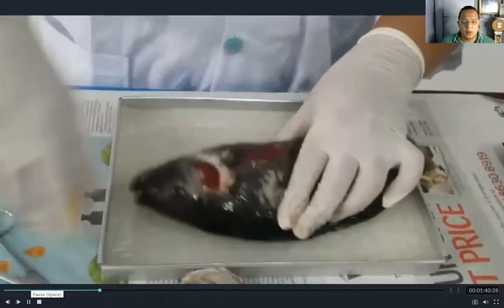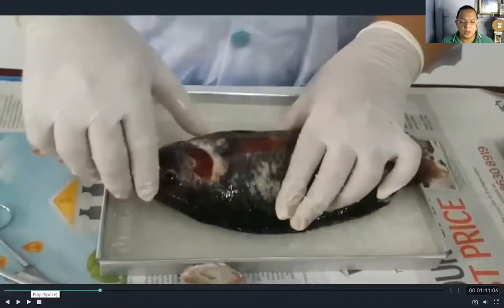So this is the gills. If you are doing dissecting — especially if you are a student — you need to ask guidance from an older family member, because it is more delicate when you use sharp materials such as a knife or scissors.